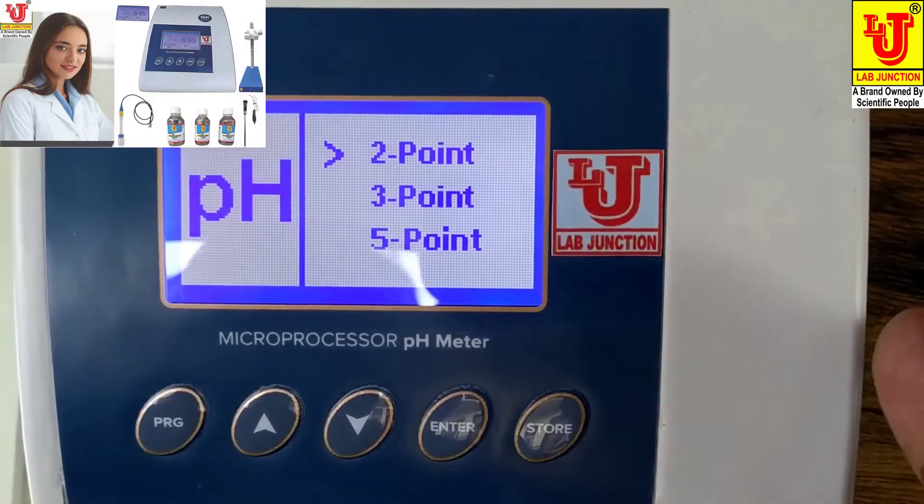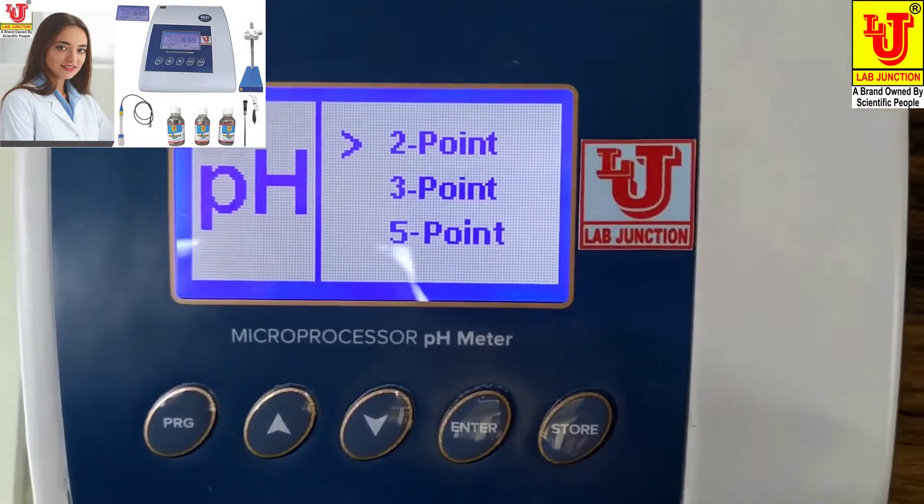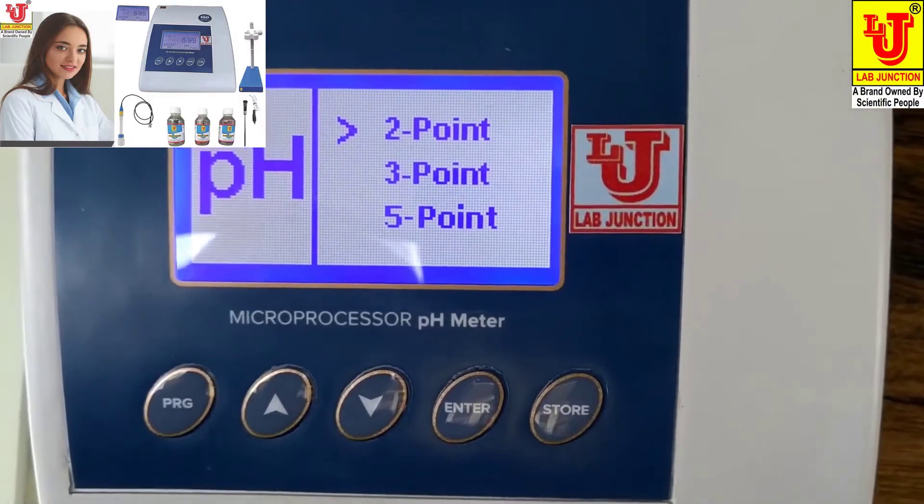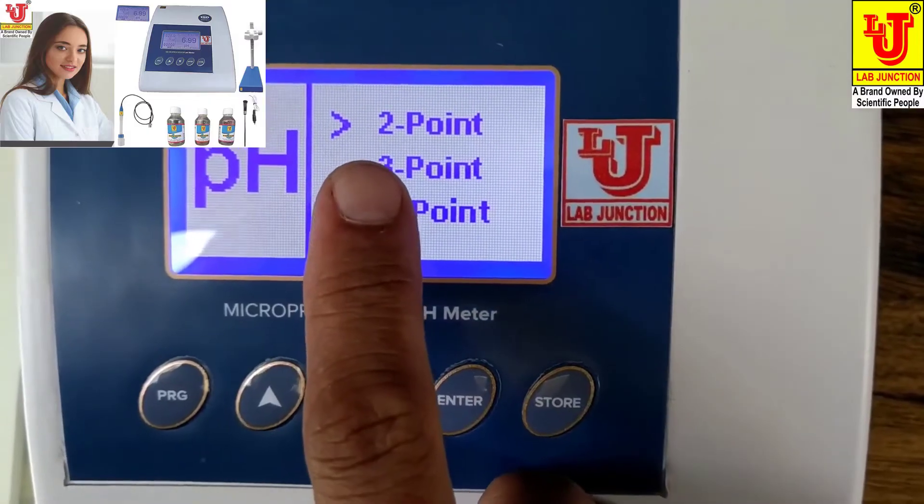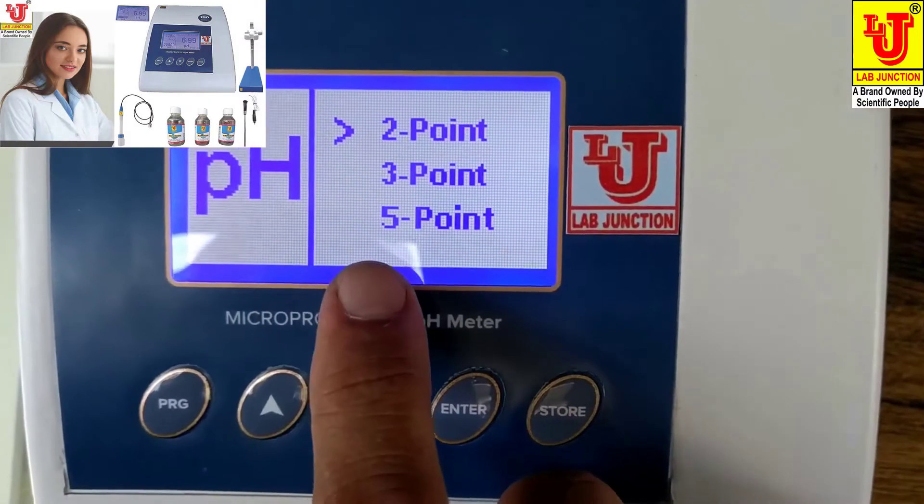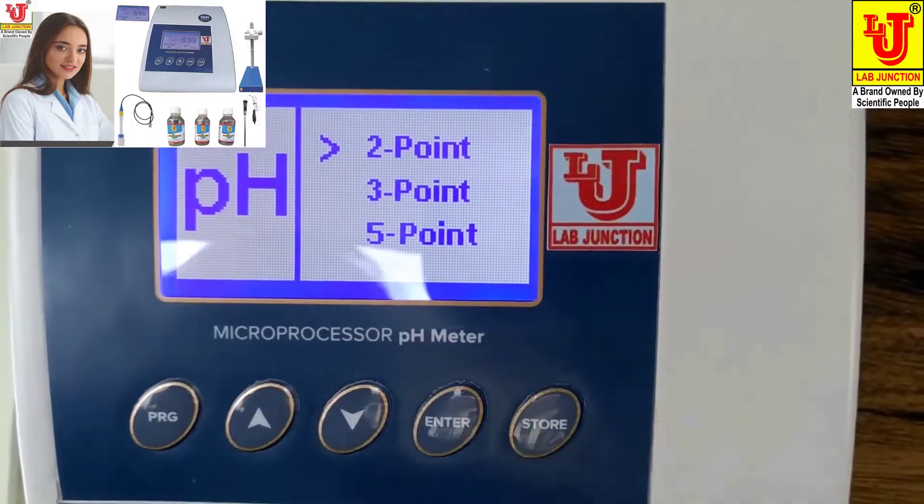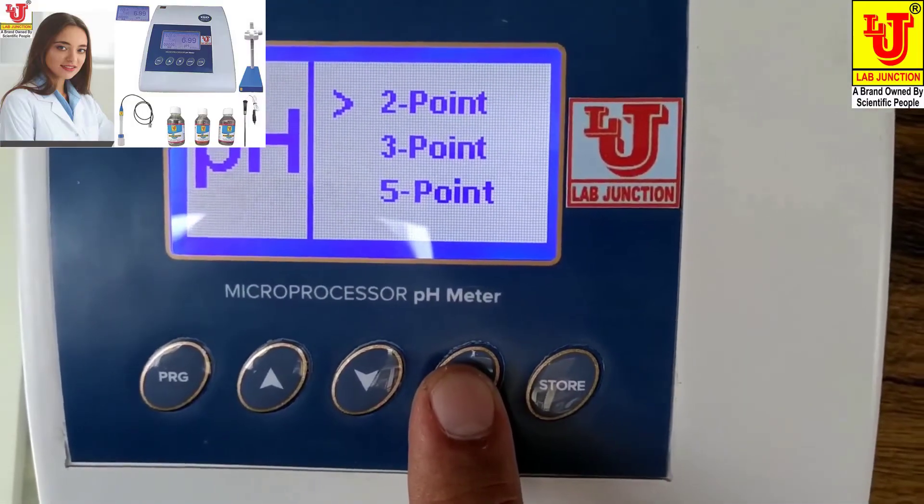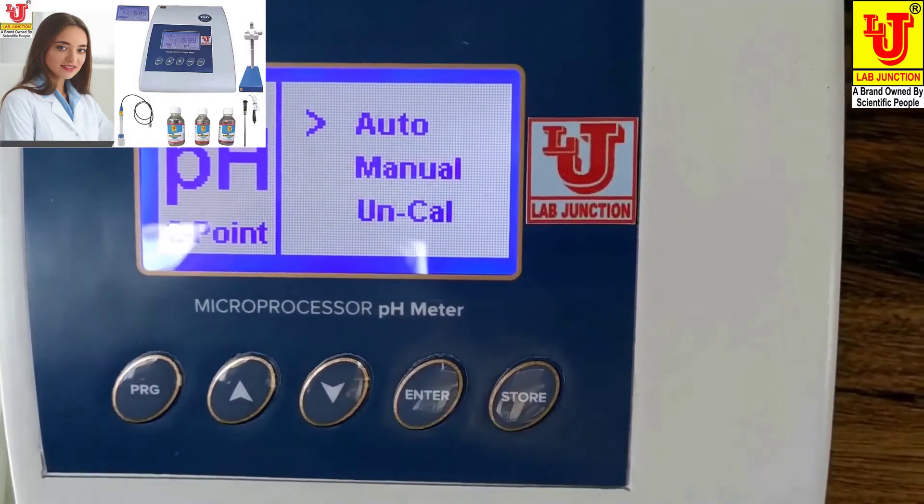This is a five-point calibration pH meter, but options are three. You can also calibrate two-point, three-point, or five-point. I am calibrating two-point calibration. Enter.